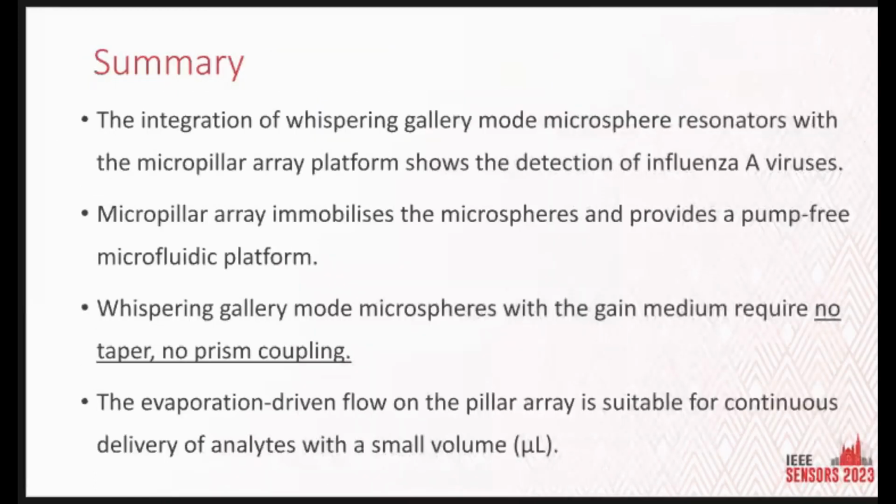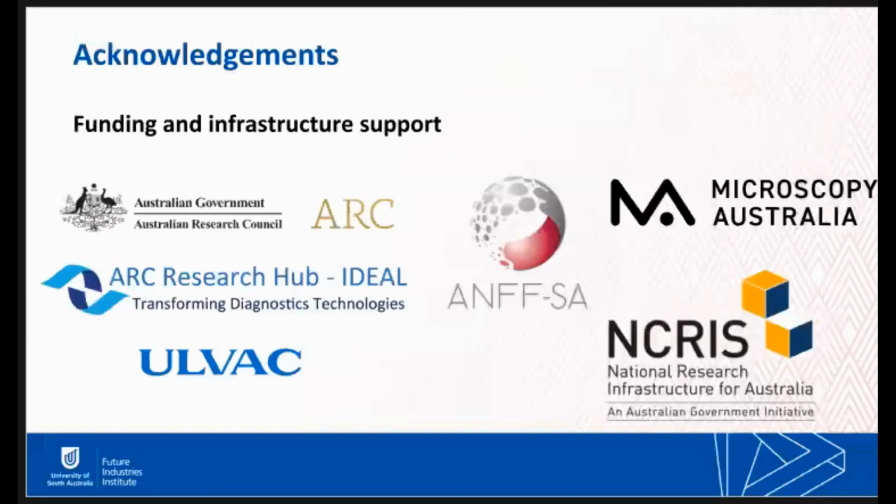So, a quick summary: I've shown this detection of influenza A viruses to show how important the evaporation-driven flow is, which can help us detect different analytes.